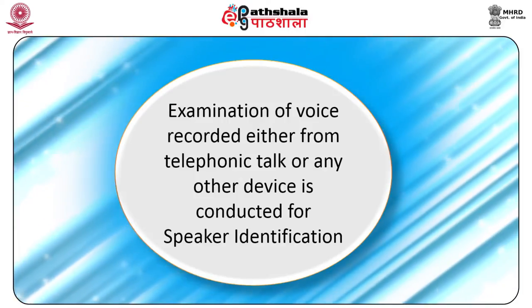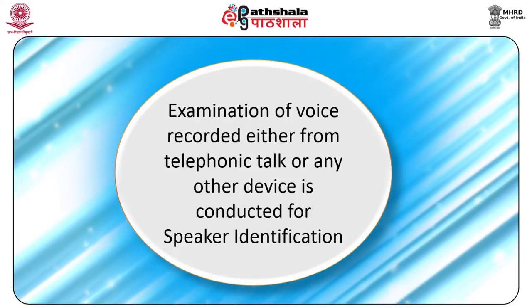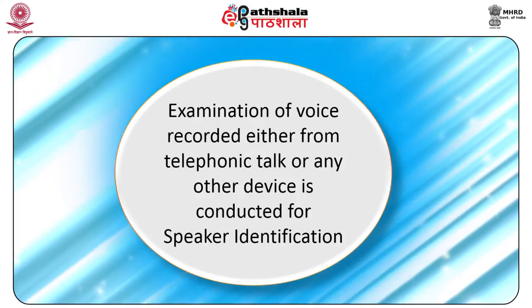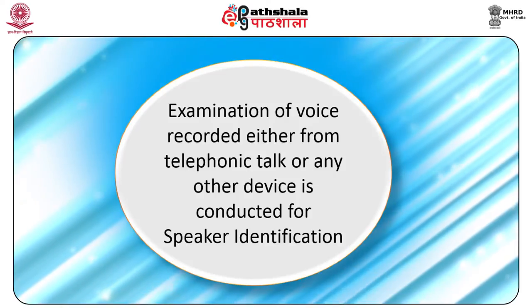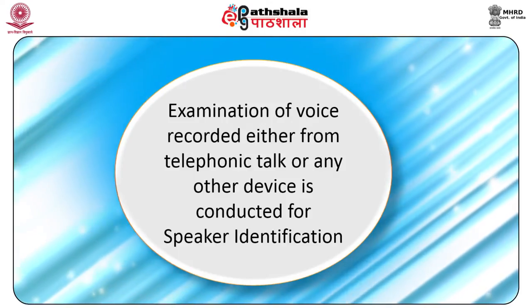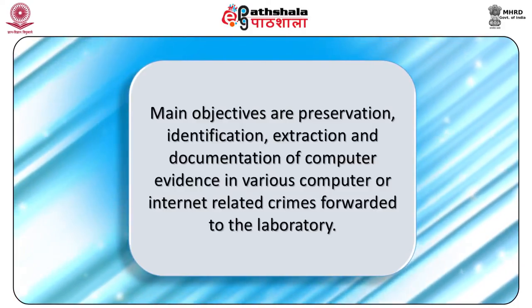Voice identification division. In this division, the examination of voice recorded either from telephonic talk or any other device is conducted for speaker identification with the help of a very advanced version of computerized voice spectrograph, namely computerized speech lab. Experiments are required to be conducted for noise reduction or signal enhancement, and audio tape authentication is done in this laboratory.